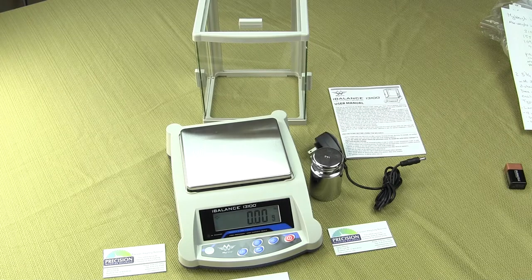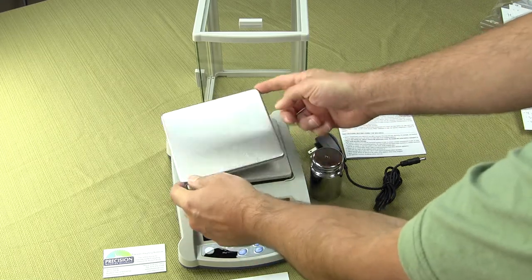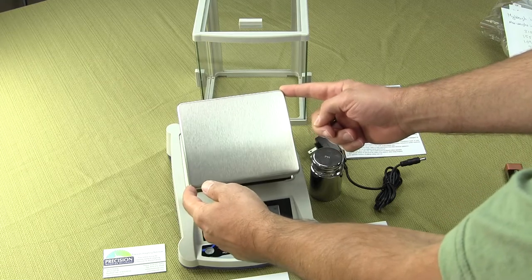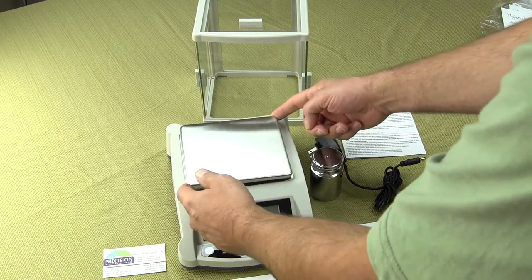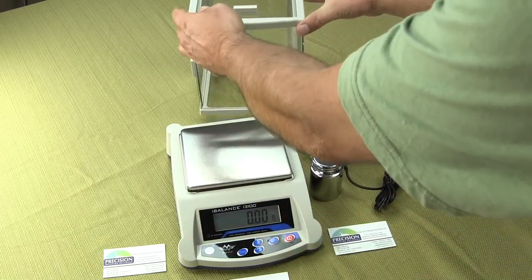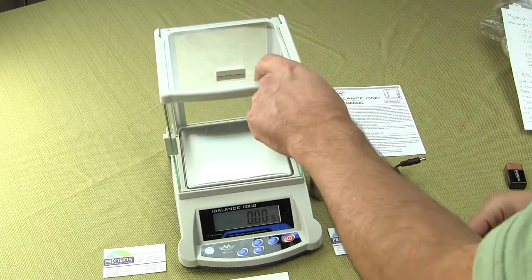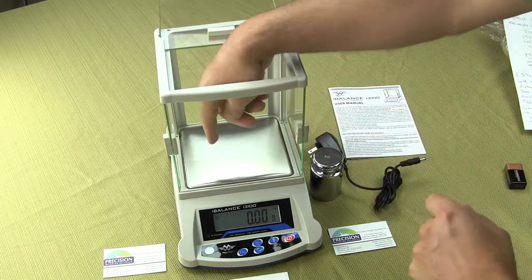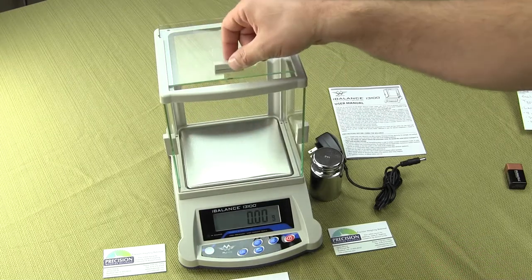It's a nice add-on feature and it's not costing you extra. The stainless steel platform is removable for easy cleaning and this platform measures five and three quarters by five inches. The distance from the stainless steel platform to the top glass — we call this freeboard — measures approximately seven inches.